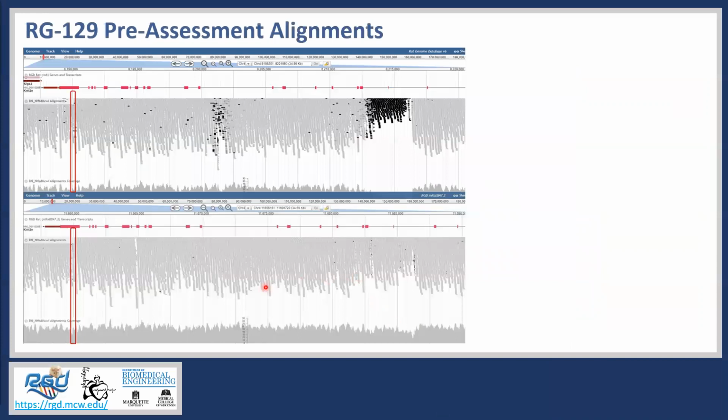Illumina short read data of the same animal used for reference generation are viewed in JBrowse. These data serve as a comparison to the long read data used to generate the reference. This step allows the curator to compare different reference assemblies and to potentially identify problematic assembly regions. The global view here shows some assembly issues from reference version 6 may have been corrected in reference version 7.2.